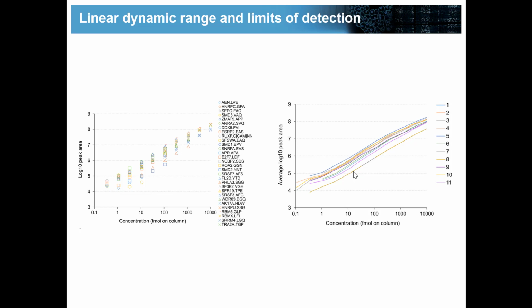So it's really only, and there's also a tool from the Macass lab that does something similar, which is not quite out yet, but I think is going to be out soon. So the tools are coming online to do that, and they have decoy models which account for the problem that you are describing, that the spectra basically are more noisy. So that should be accounted for in those models. I guess that's what I would say about that.